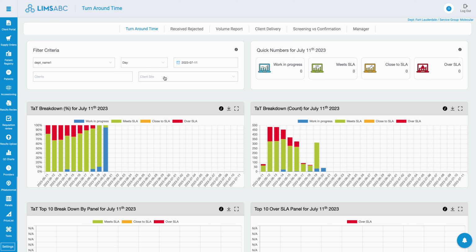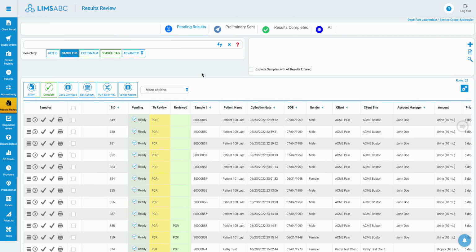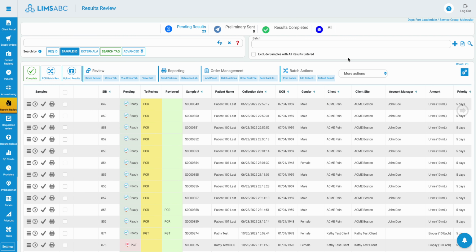Hello, everybody. Gabriel Bolint here, product manager for LIMSABC, and today I'm going to show you how LIMSABC works with different batches, including toxicology or molecular batches. For that, I'm going to head to our results review screen. Everything is done via our results review screen.